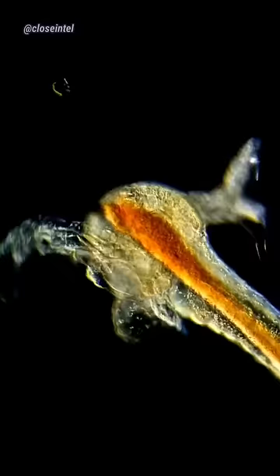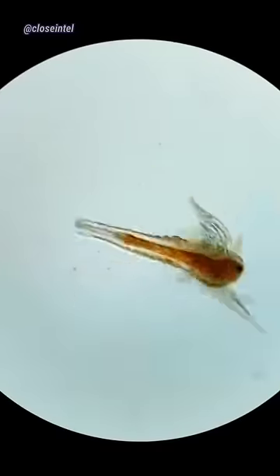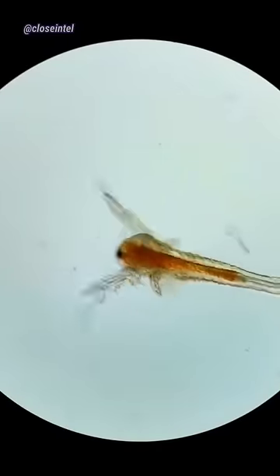They're only born with one eye but it later becomes two when they reach maturity. They're also attracted to light, so finding them in the tank won't be hard if you have a flashlight.